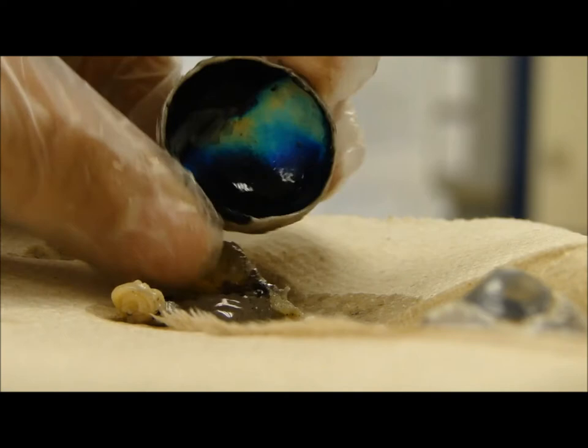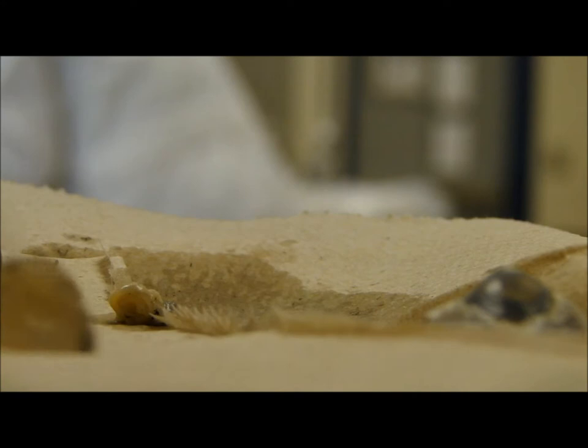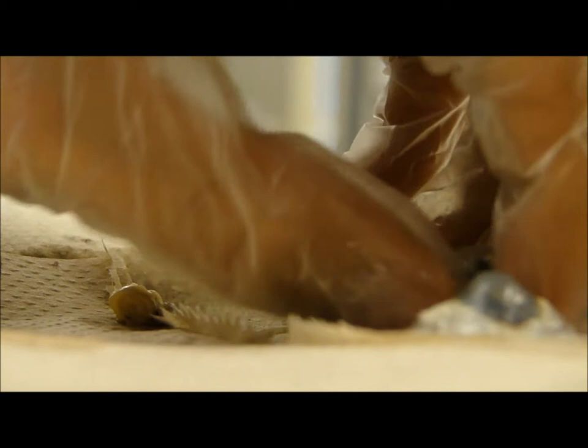Everything looks beautiful on the camera. Ew, what does it feel like? Feels like a jellyfish. A baby jellyfish.